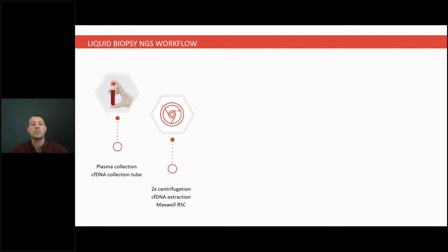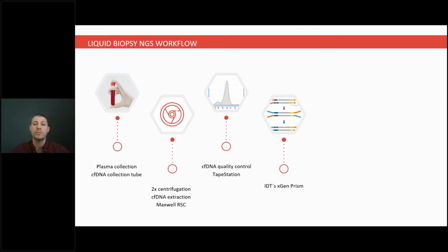For the extraction, we use a Maxwell instrument from Promega. Then we perform quality control with a TapeStation to see how successful our extraction was.